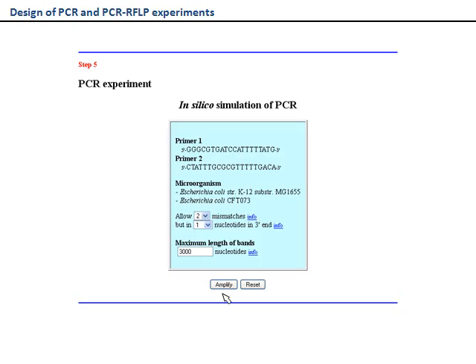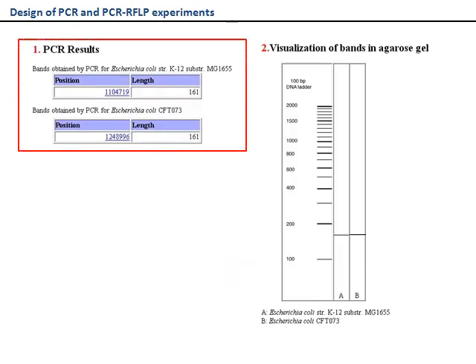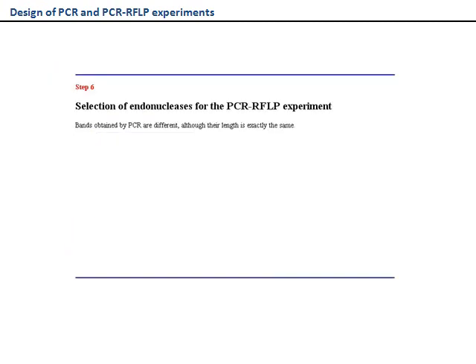An amplification will be performed again. Now, amplicons are obtained for both genomes, and they are also visible in the electrophoresis. In cases where amplification is obtained for both E. coli genomes, a question related to stringency and a link to jump to step number 6 are shown.